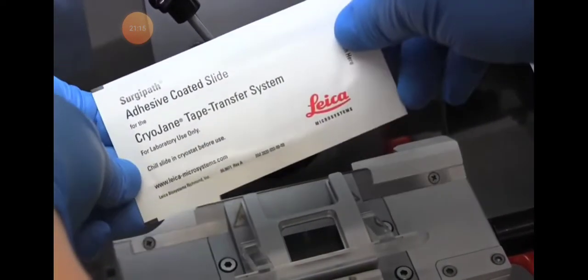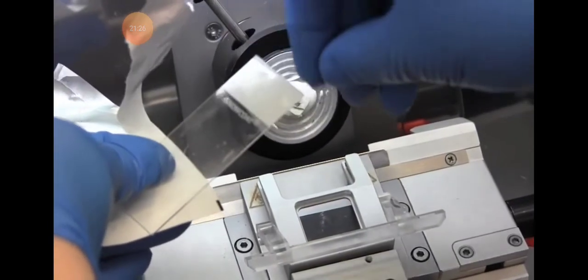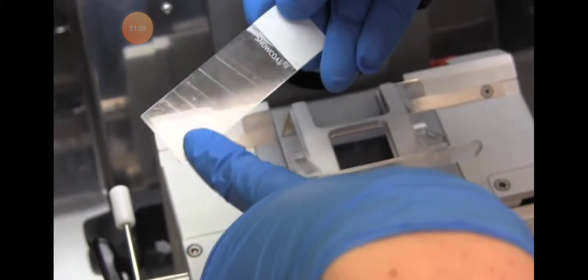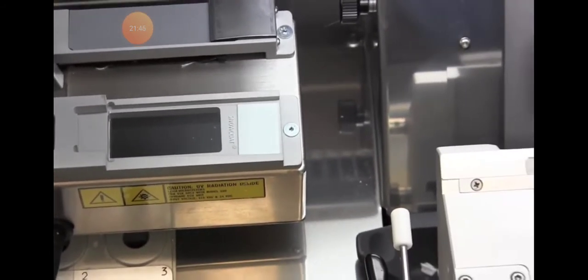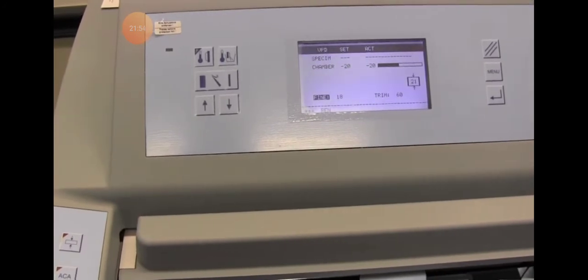Those slides are specially made for the Cryo tape transfer system. You have to open this packaging, and you can see where it says snow coat. As long as it's not backwards, you have the right orientation, and you remove the protective adhesive, and then throw away the waste. The protective adhesive keeps this coating clean and protected, because that's what's actually going to be transformed by the UV light to allow for the sample to adhere really well. So let's set to the fine adjustment.